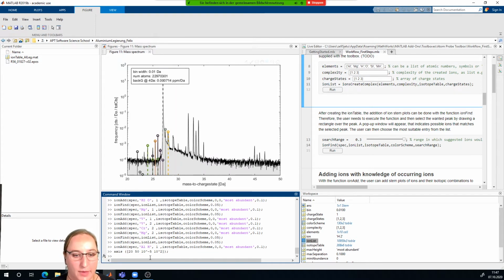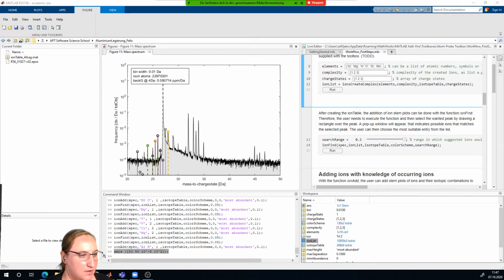And now you have back your mass spectrum really nice. I will also copy and paste it. I add. Oh, sorry. No. And this one. So you can also do it like you want.